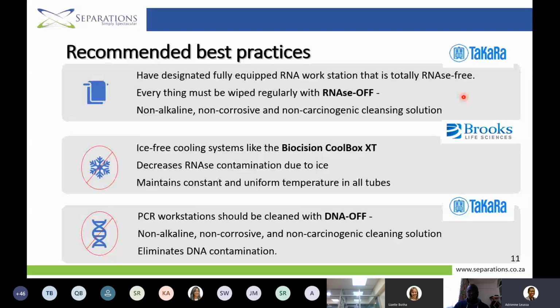And we have a solution that is non-alkaline, non-corrosive, and non-carcinogenic, which is RNase off from Takara. In another related work, if you're going to be doing any PCR work, there's a DNA off that also is from Takara that will allow you to eliminate potential DNA contamination of your PCR solutions or products.